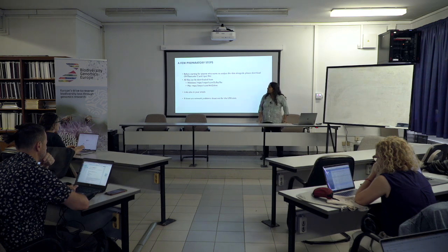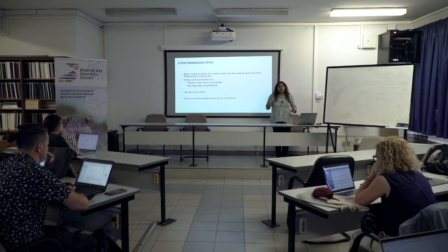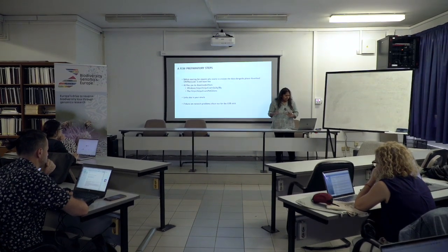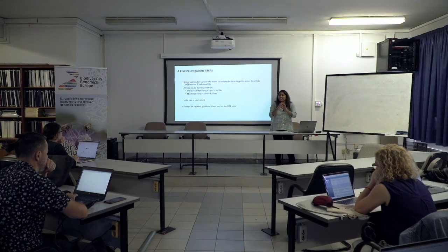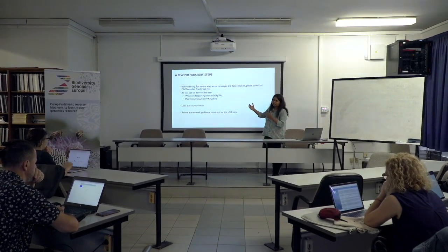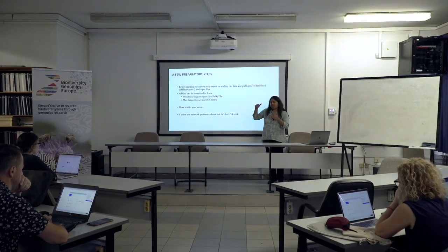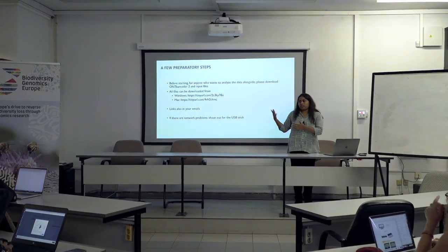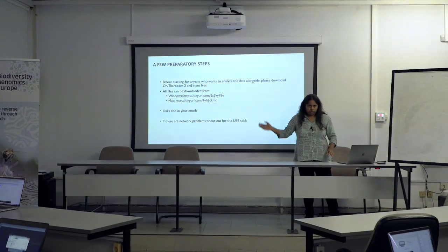I think this is going to be... so the objective behind developing the ONT barcoder software was to reach out to everybody and make it easy for running analysis. So I don't think it's going to be that complicated to run. So what I'll do is mostly talk through the slides and explain the various variables that can be changed and what is happening behind the scenes in each of those steps.